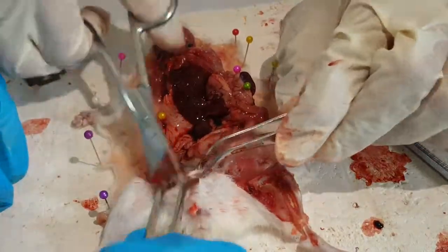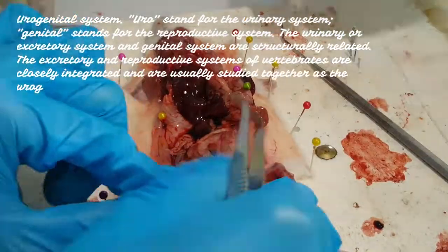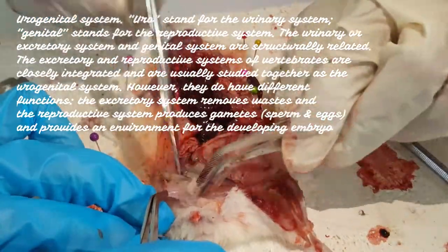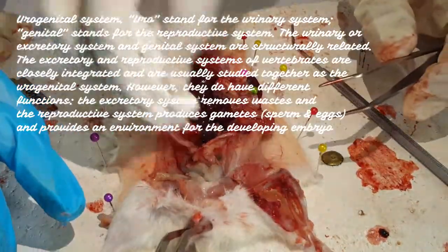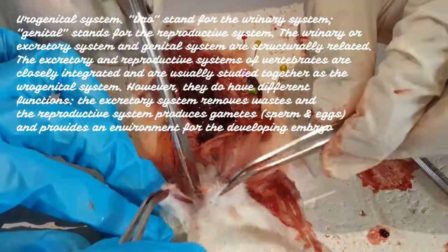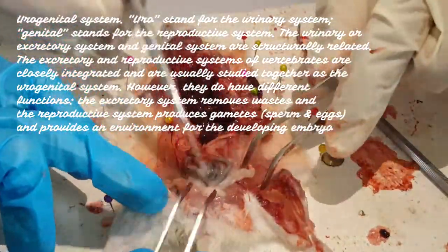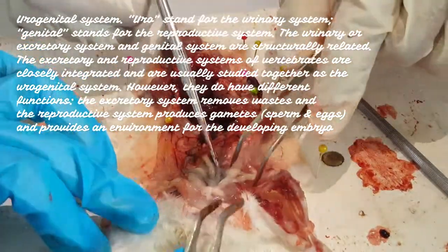The urogenital system: uro stands for the urinary system and genital stands for the reproductive system. The urinary or excretory system and the genital system are structurally related. The excretory and reproductive systems of vertebrates are closely integrated and are usually studied together as the urogenital system. However, they do have different functions.